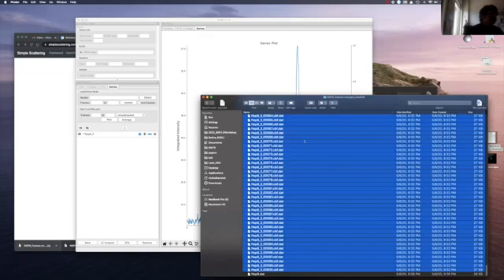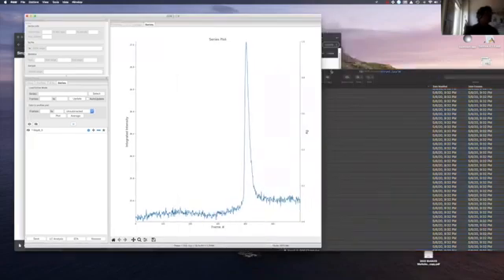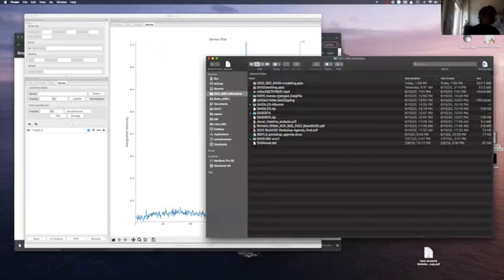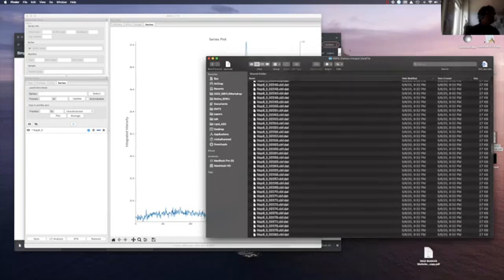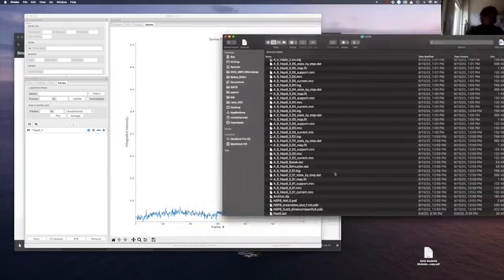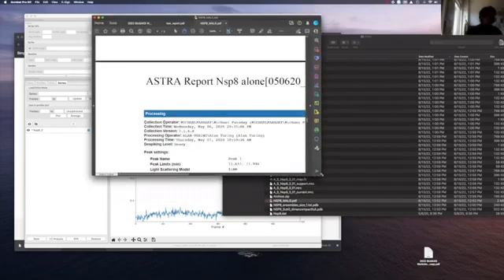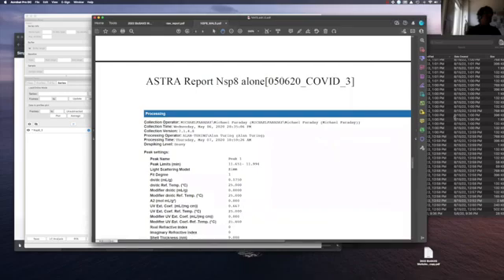What I also recommend, before you look at the SAXS data, is to look at the MALS data report that you're also sending out. So here is the report for the MALS data. You will get a bunch of data sets that are the raw images, but you also get a PDF file and a README file so you know what everything means. There is the so-called NSP MALS PDF file, which is a report in PDF format. It's most important to look at that, as it just gives you an initial idea of the quality of your data sets.